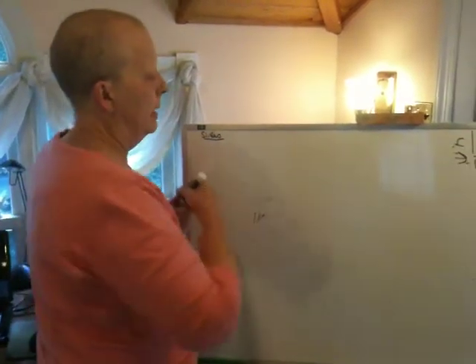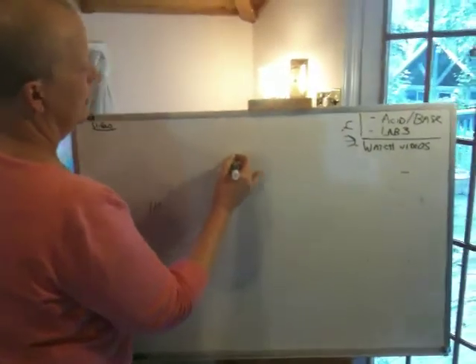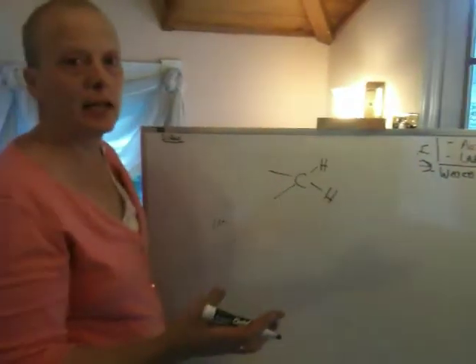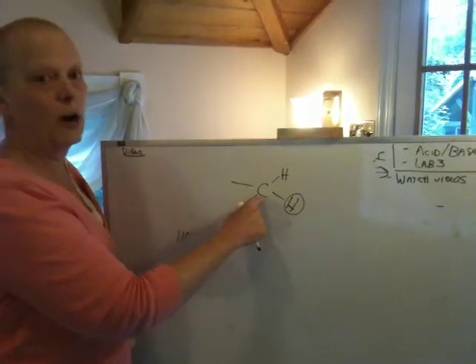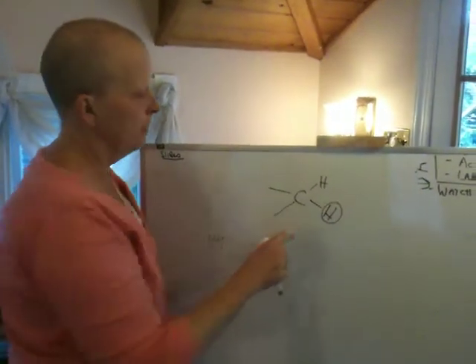Before I do that, I want you to be aware that, because you've learned this in class, I'm sure, to some extent, what you learned about hybridization carries into IR. So there's a very definite trend for hydrogens relating to the carbon they're attached to. This is one of the first very specific things I'm going to teach you.